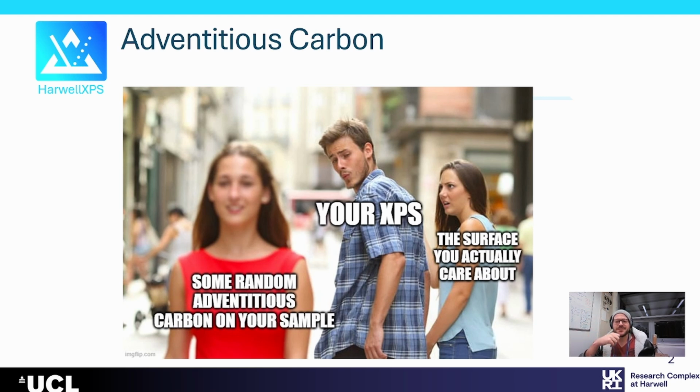If your samples have been loaded from atmosphere, been in your lab, sitting around, or worse, you've touched them with your fingers for some reason, you're going to have carbon on your surface. Yes, this can be a pain, but this can also be a useful way to energy reference if you've got insulating samples. So it's a bit of a blessing and a curse.